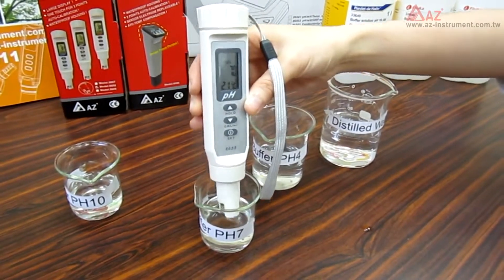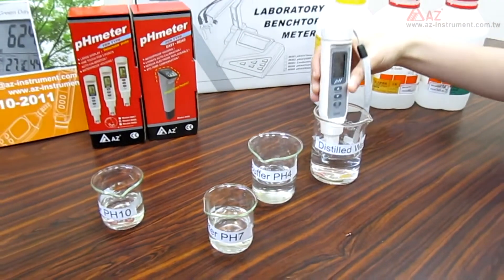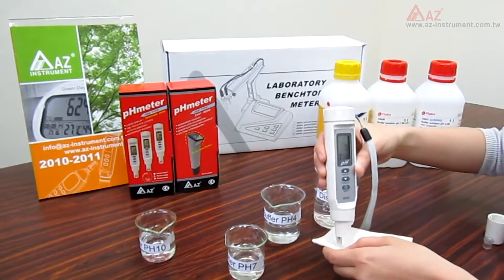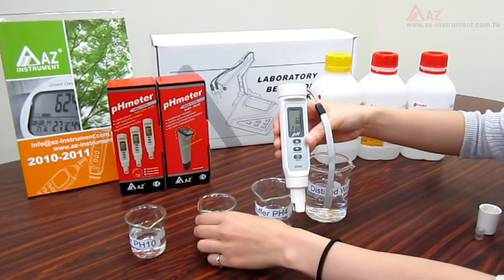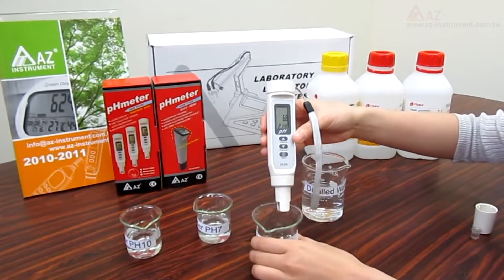Just clean the electrode with distilled water again, and you can proceed with the calibration of pH 4 and 10 by following the same procedure.